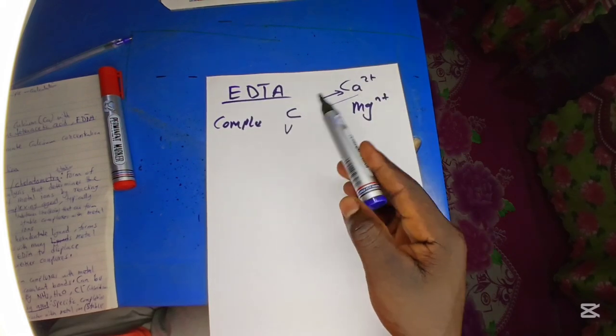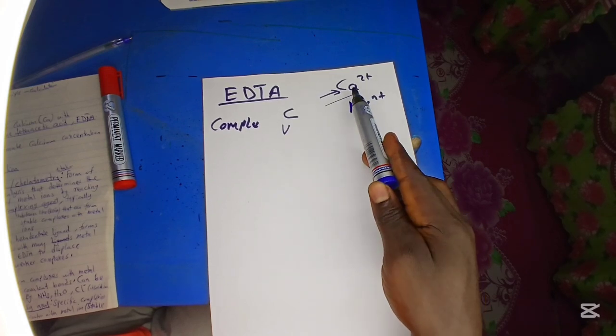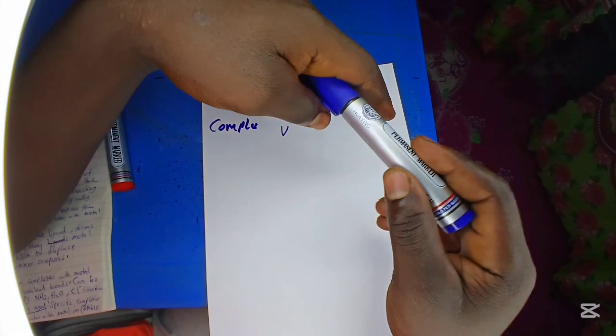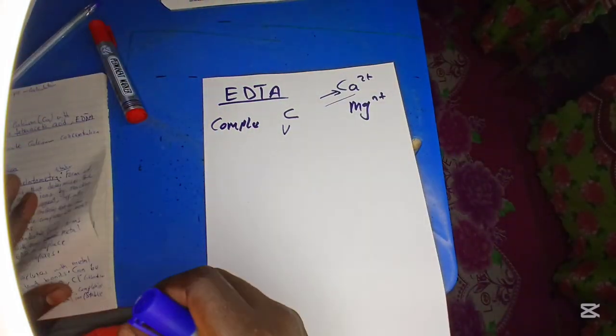We therefore balance our overall equation and calculate the concentration of Ca2+. So it's possible. I don't want to dive into it now. Let's go to the procedure so that you get to understand more.